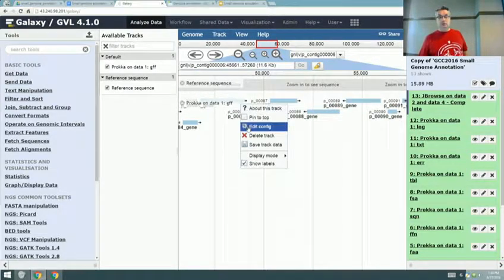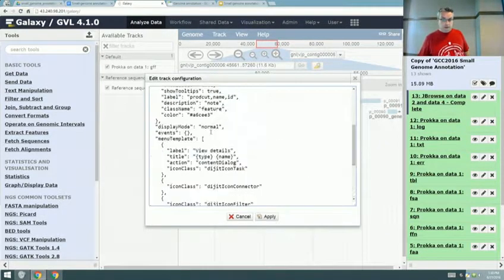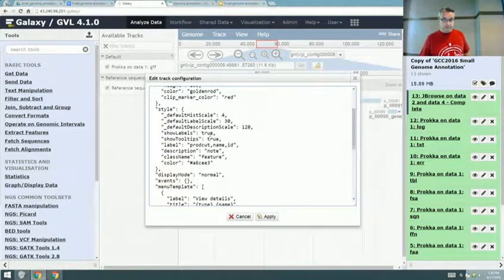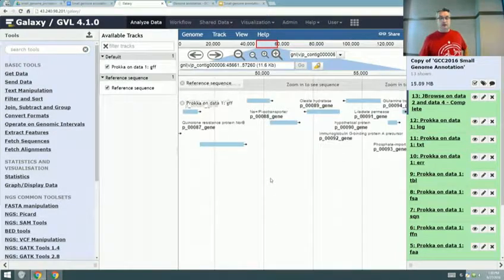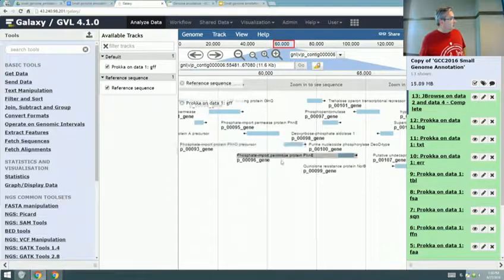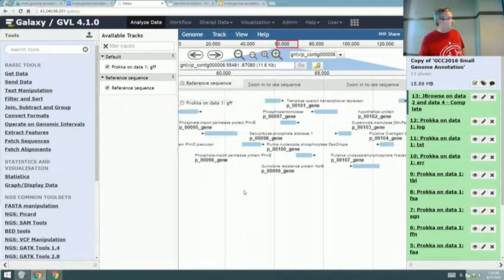Not yet, I will. I thought it automatically did now. Yeah, I thought so too, but I don't know what Eric did. Labels, products, prod cut. There you go. Prod cut, I think that was the problem. It's a typo. So suddenly you can see the products on there as well now.